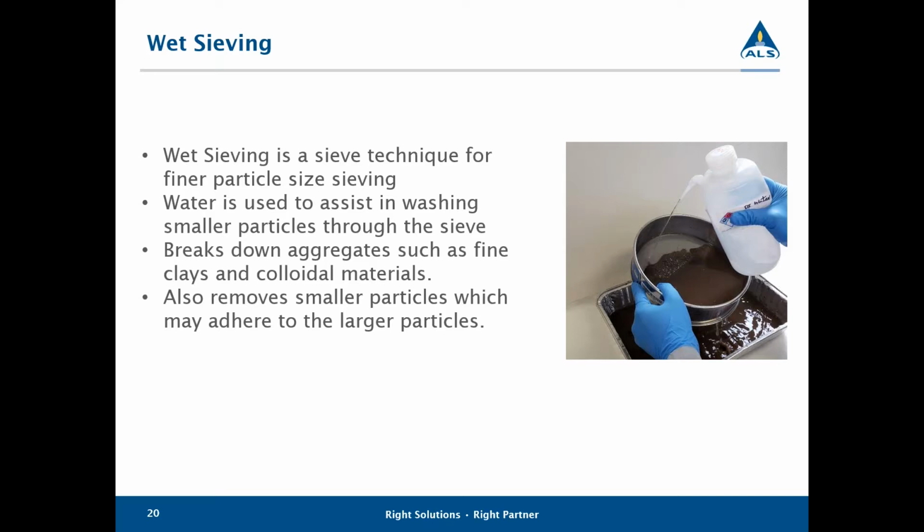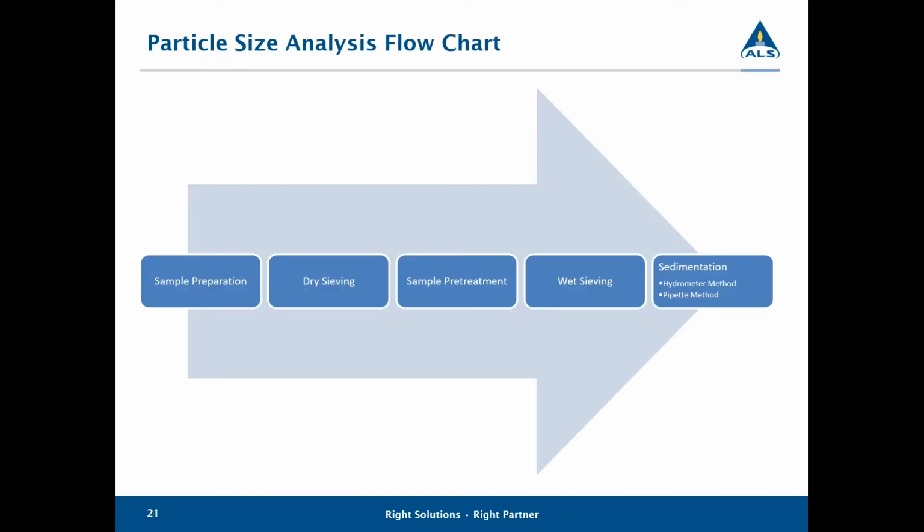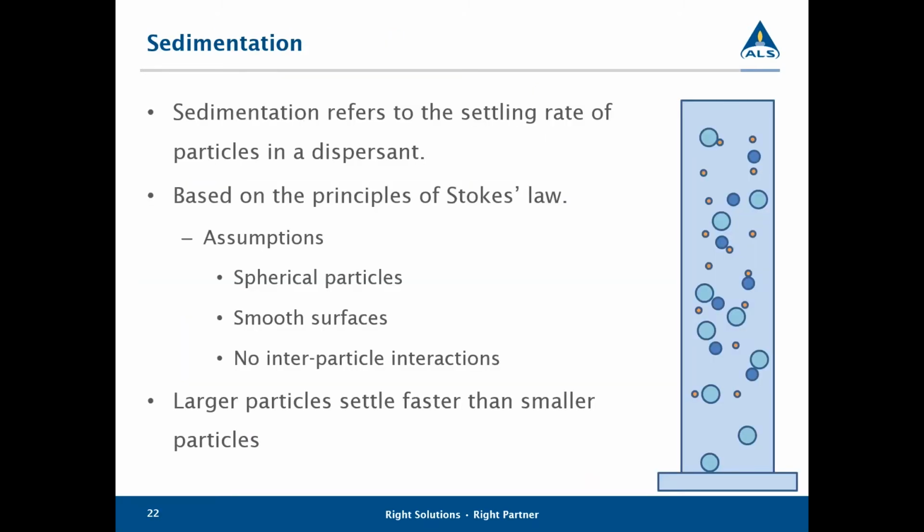Moving on to the next part, which is sedimentation. Sedimentation refers to the settling rate of the particles in a dispersant. This is a method that's based off of Stokes' law, which states that larger particles settle faster than smaller particles.